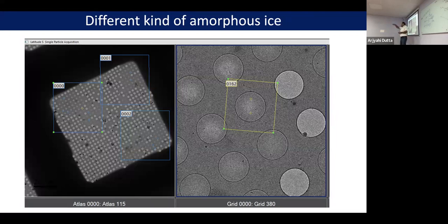What should be the beam diameter? We should not say spot size, because the same spot size is used for the condenser lens 1. The spot size helps us determine how much electron dose is coming. So here we can say what the beam diameter is. Generally, you can consider 1.6 or 1.62 micrometer as the beam diameter, so it should not expose the entire hole also.